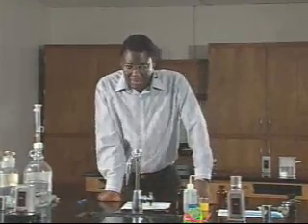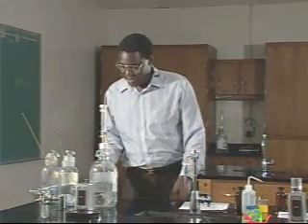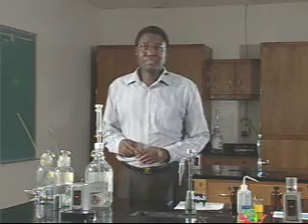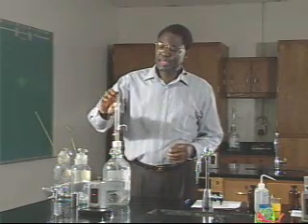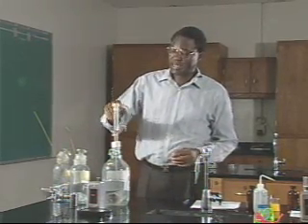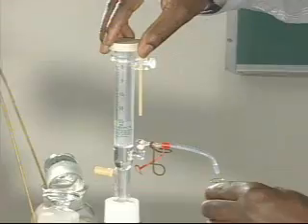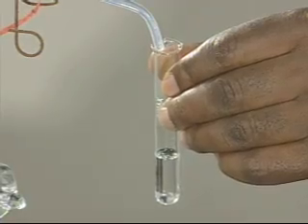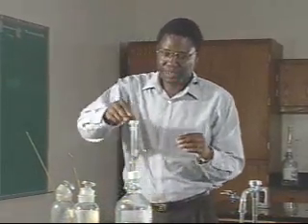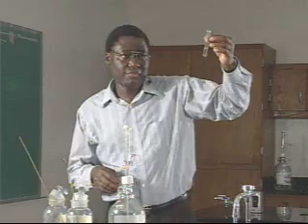I'll demonstrate the first part of the experiment. The first thing we need to do is get some acid. Here's a container, and you have this autopipette — it's all been set for you, so don't adjust anything. Take your test tube, lift the pipette up once and then gently press down once. Do the same with the second test tube — up and down — and we've got enough acid for our reaction. This is 6 molar hydrochloric acid.